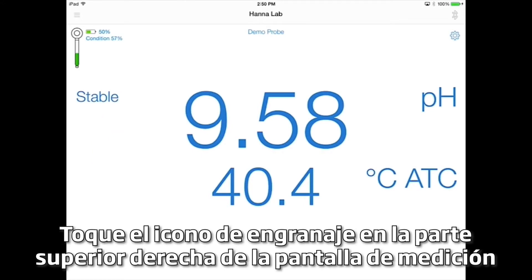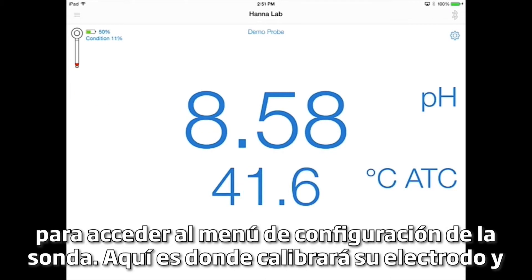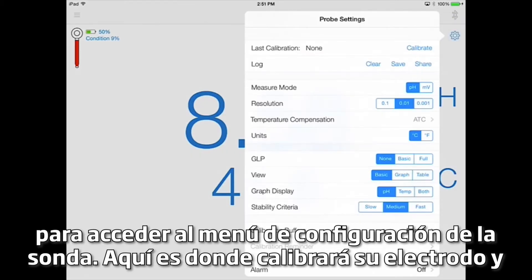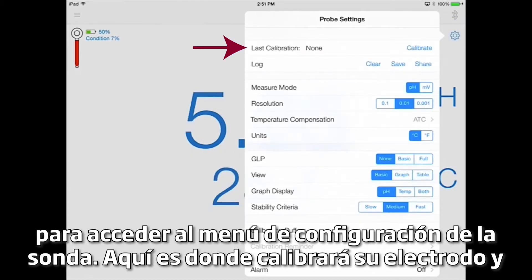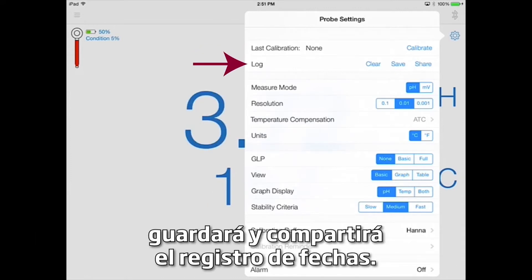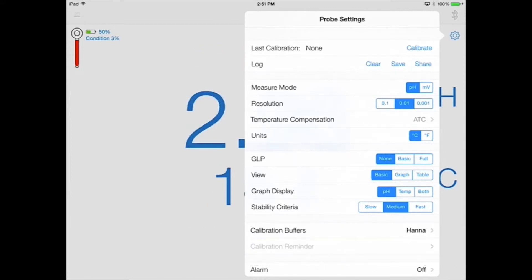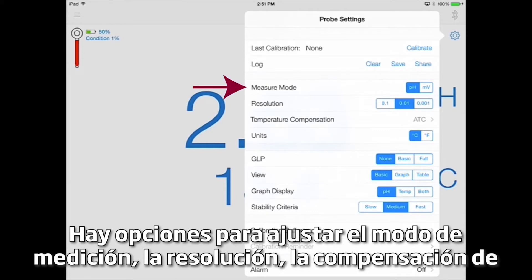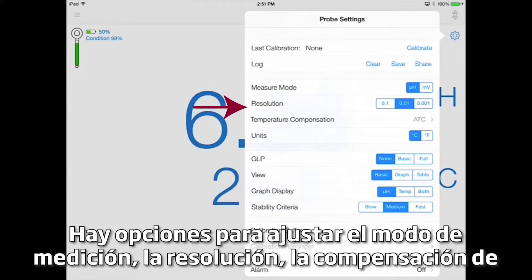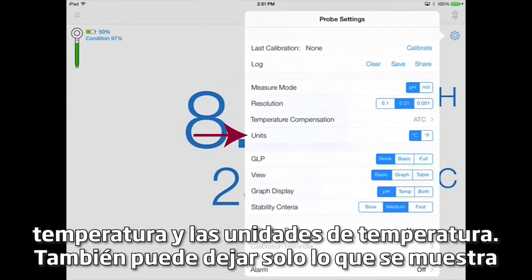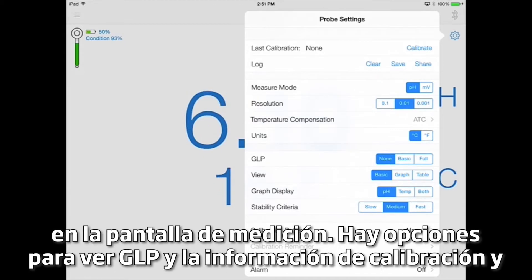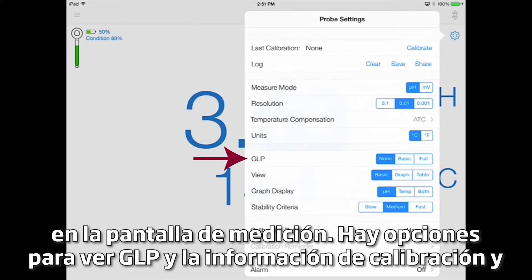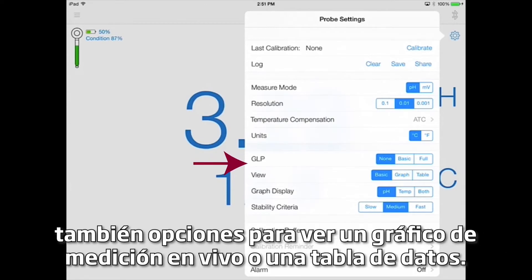Tap the gear icon in the top right corner of the measurement screen to access the probe settings menu. This is where you'll calibrate your electrode and save and share the data log. There are options to adjust measurement mode, resolution, temperature compensation, and temperature units. You can also adjust what is displayed on the measurement screen, including options to view GLP and calibration information, and also options to see a live measurement graph or data table.